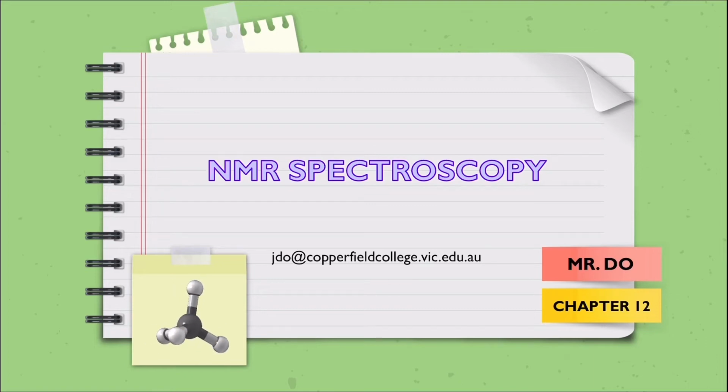Hello class, in this video we'll explore what NMR spectroscopy is, how it works, and how to analyze the spectroscopic data from this technique. This is going to be a lengthy video as there are a lot of things to unpack, and it is often the most challenging thing to understand amongst the different spectroscopic techniques.